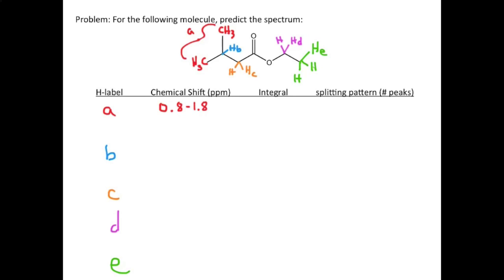Okay? Why don't we do all our chemical shifts first? If I look at HB in blue, H to sp3 carbon, and what is that attached to? An sp3, an sp3, an sp3. Again, that is my normal situation. Nothing out of the ordinary.